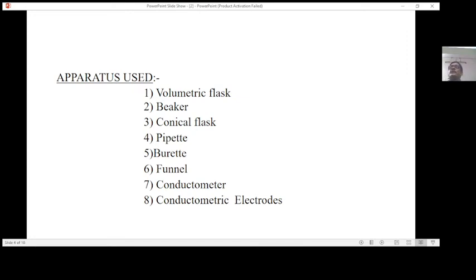We have to compare the conductometric titration with the regular titration method to know the concentration of HCl, also the normal laboratory case of using phenolphthalein indicator.